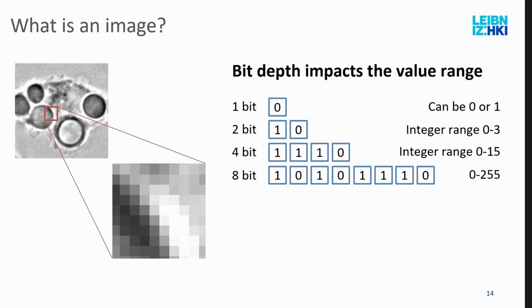And then 8-bit, this is usually the lowest image data type that you work with, 0 to 255 in general. And you see it everywhere. An image is prominently called an 8-bit image. It's the one that has 8 bits assigned for a pixel, and it can store 0 to 255 as values, and not anything more.